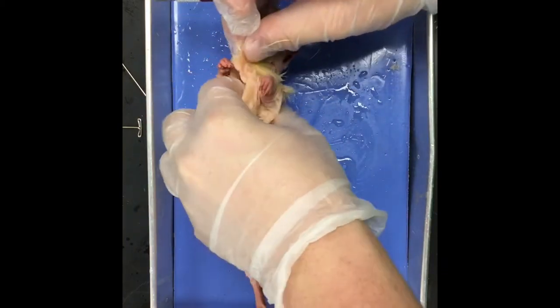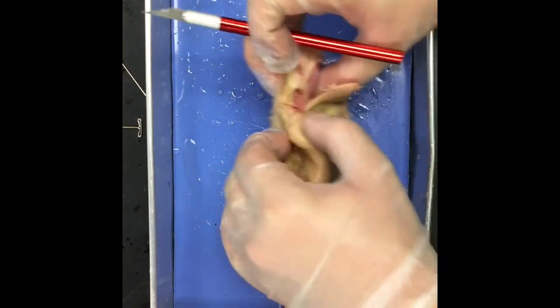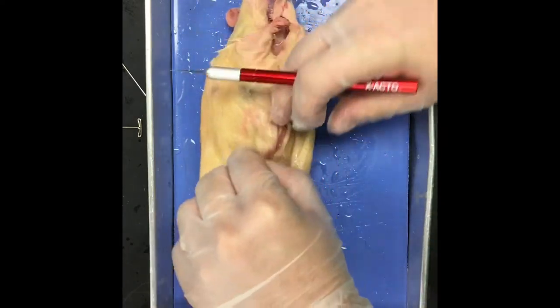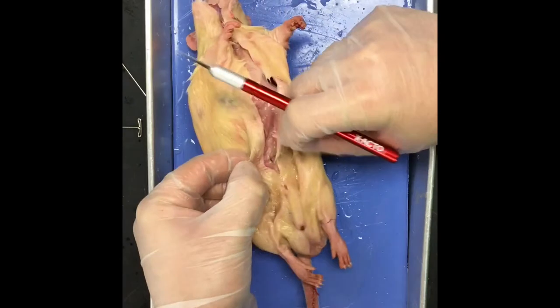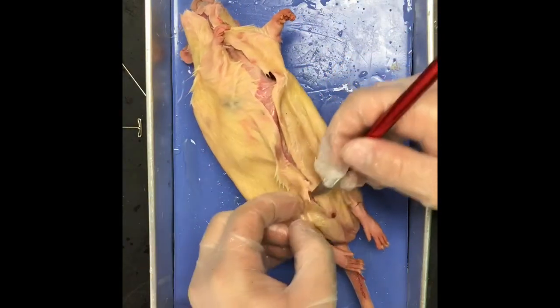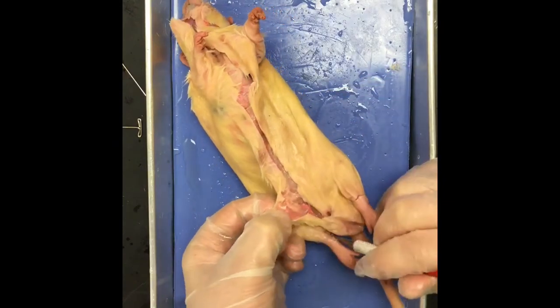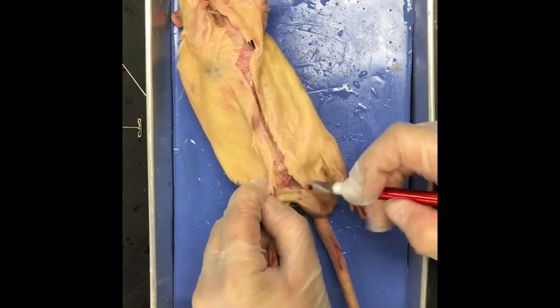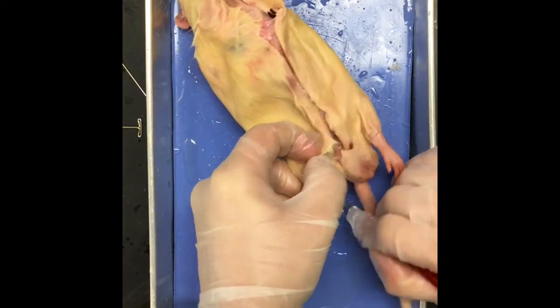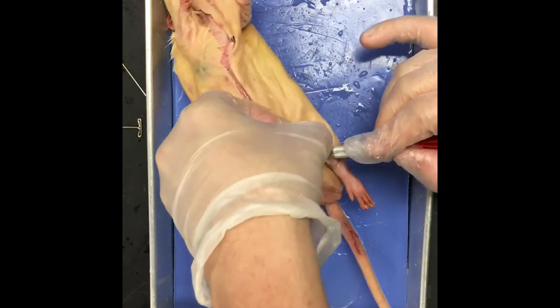All right, so that's the first step there. You've gone through and separated all of this part. You're gonna go down, and you're gonna do the same thing on the lower end. So you're gonna follow this lower end. You're gonna go below the legs so you can completely remove that next. Now again, while this is similar to skinning a deer, it's not the same. So if any of you guys hunt, this is a little bit different.